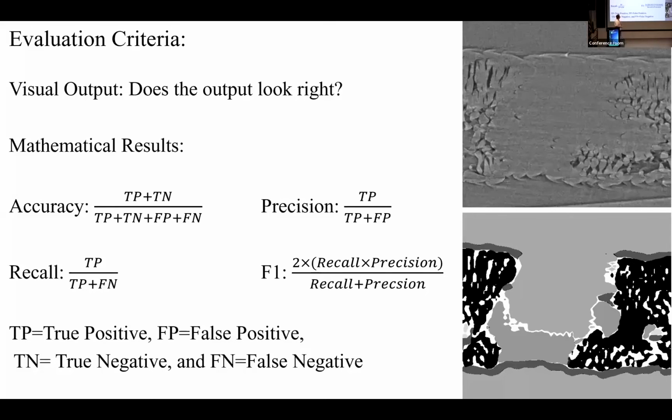But once you have a reasonable representation, then you can select your best model based on the accuracy, precision, recall, and F1 scores that are generated during testing. Precision is just out of all the predictions that are made, how many are correct, and recall is of all possible correct predictions, how many were correctly predicted. And then the F1 score is the harmonic mean of these two. It's kind of nice to balance these two evaluation criteria.